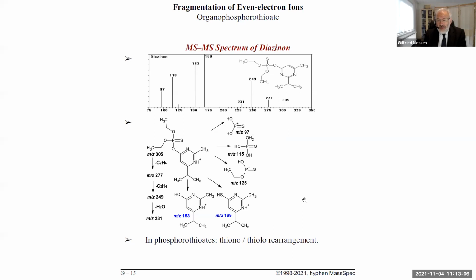Okay, that's good. But in that case, there are also some other atom rearrangements, not just hydrogen. Basically, other atom types can rearrange in that case. Yeah, but we have seen not only hydrogen rearrangement, but also rearrangement of larger groups. We have seen dichlorobenzyl rearrangements in the last exercise which we did. Yeah, but in terms of atom hopping, okay. Thank you.